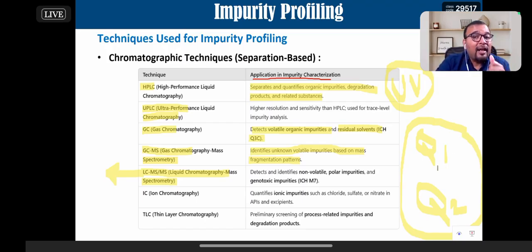And this technique is widely used for analysis of nitrosamine. So I think this is a very hot topic. And for nitrosamine, though HRMS is preferred, it is a very high cost instrument. But MSMS can suffice the requirements. That's the reason the triple quadrupole MSMS is sufficient for analysis of nitrosamine impurities. Ion chromatography can be used for ionic compounds, the compounds which can undergo ionization.